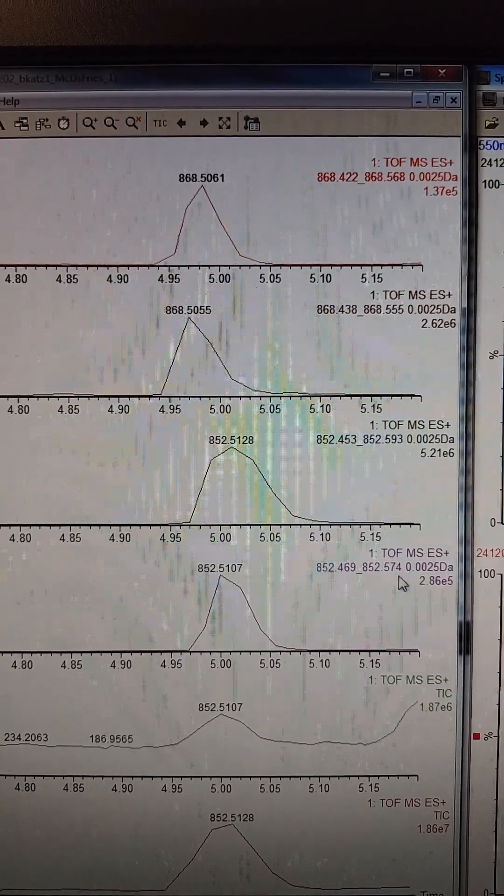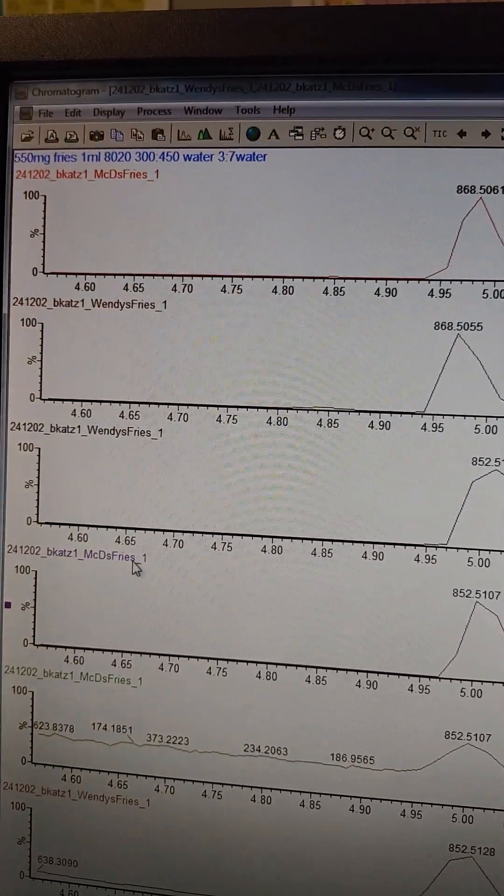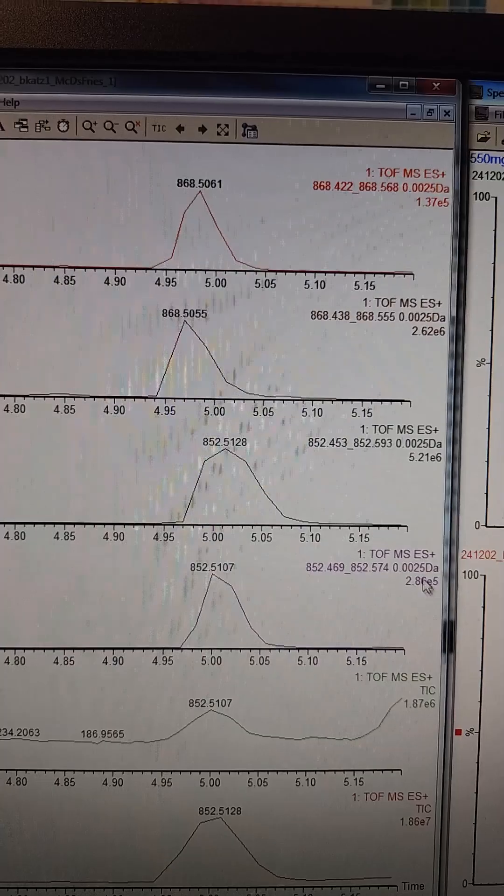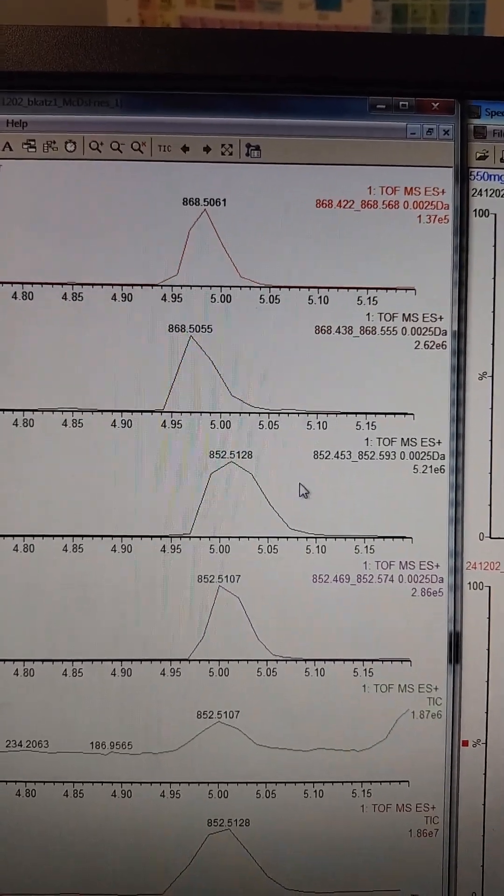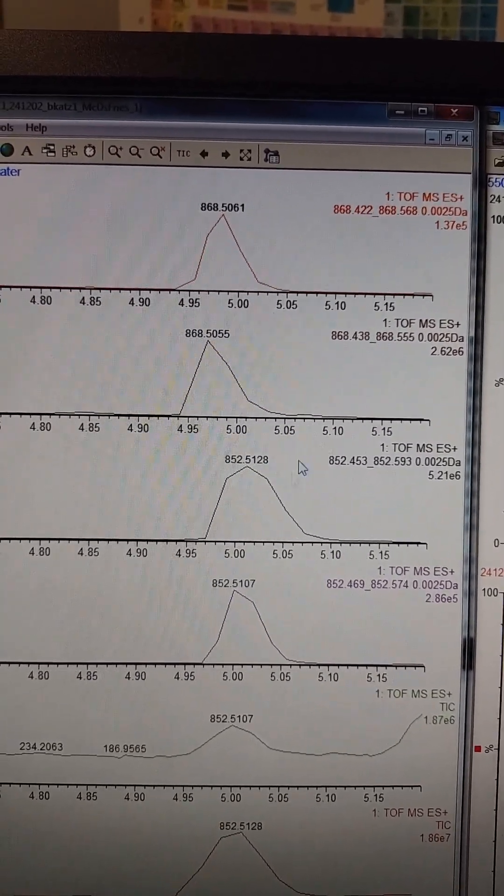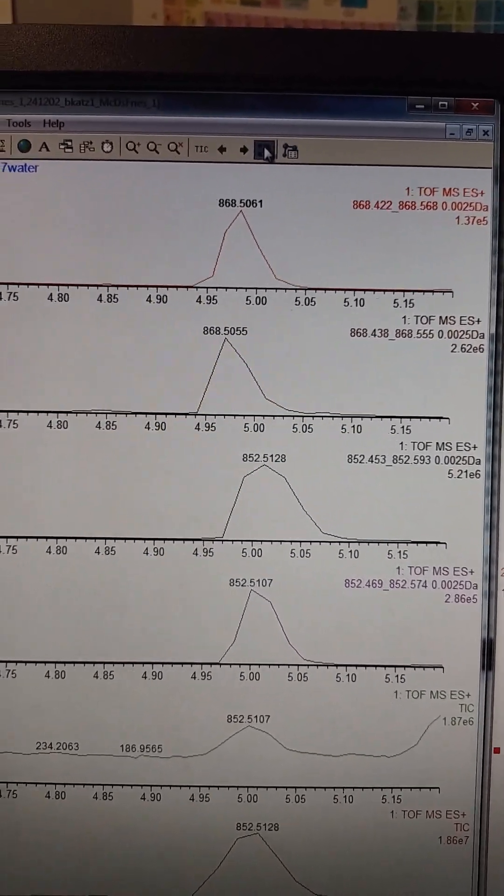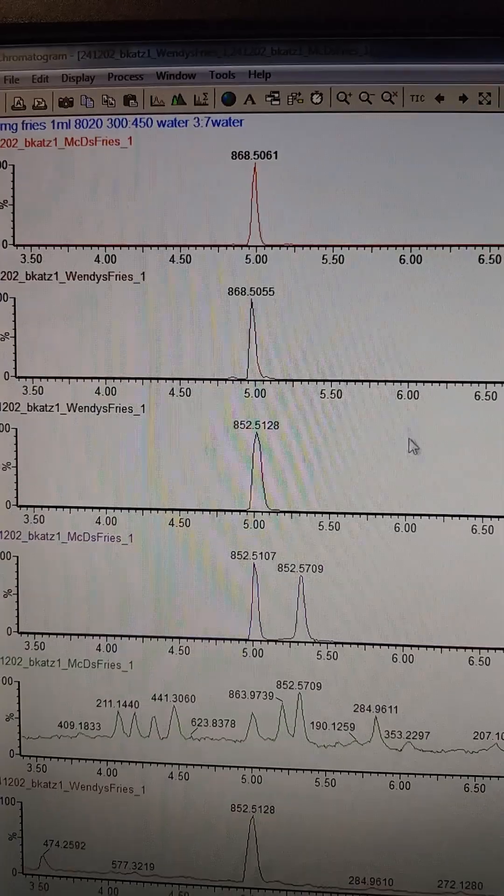And then the same thing with the 852 mass. You can see in the McDonald's, we're at like 2e to the 5. And over here we have 5e to the 6. I mean in 5e to the 6, like e to the 6 is kind of what I've been seeing in french fries. So the McDonald's is so incredibly low.